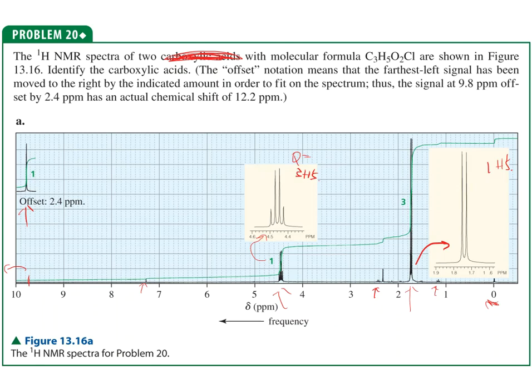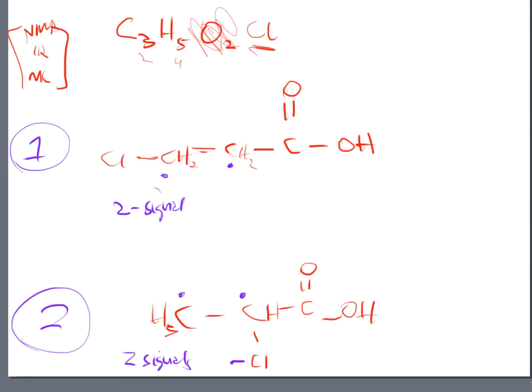So this gives us a step in the right direction, so that we know whether these are really signals or not. Based on this information, no. Those are super tiny, super small, and they are probably not major signals that I need to be concerned with. That's very often the case, not every single time, but very often. So where's that other kind of signal coming from?